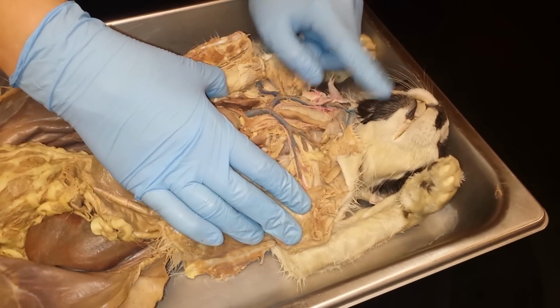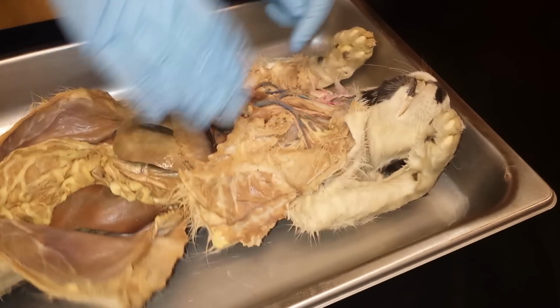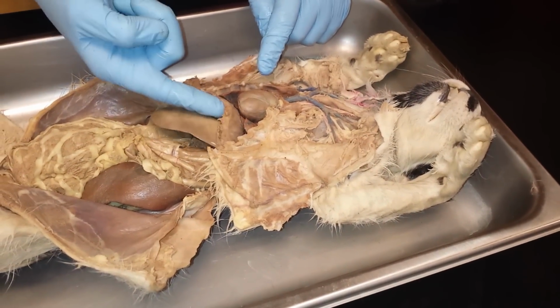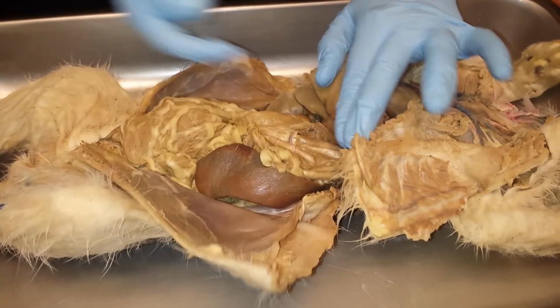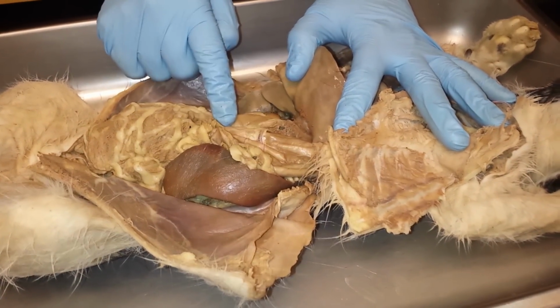esophagus. So the esophagus will go from the oral cavity to the stomach. It will run parallel with the spine through the thoracic cavity. It will enter through the diaphragm, which is what separates the thoracic from the abdominal pelvic cavity, and into the stomach. So this organ right here, this sac-like structure, this is the stomach.